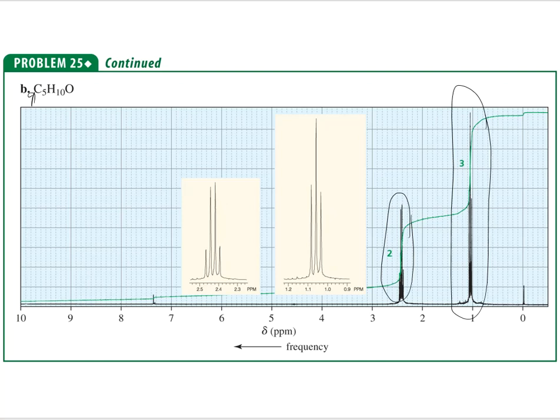So this means I'm probably going to have something symmetrical, and my symmetrical mind will go to this idea of splitting the molecule directly in half and creating a plane of symmetry, or a ring system. Now, the ring system maybe not so much, because there's just 5 carbons, not 6, and I can't create this benzene ring. Benzene rings, pretty stable. However, these 5 carbons, 1, 2, 3, 4, and 5, could look something like this. Maybe those carbons are all in a straight chain. I don't know. I'm guessing. And we're going to see if this is actually going to match up a little bit later.